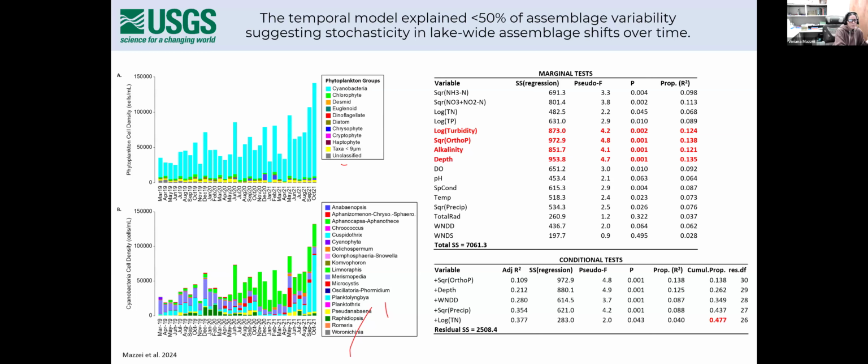From the same samples we collected, we had the morphological analysis done, and then metagenomic and transcriptomic studies. There we can also see if we had these cyanotoxin biosynthesis genes. And the proteomics we're going to do is seeing what metabolic processes may be happening. So there's a lot more to get into.